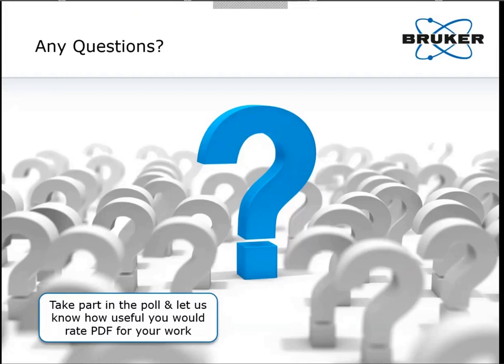Yes, that's correct. So the sample needs to meet two requirements. The sample should be absorbing enough that you don't penetrate the sample too much, and you need to have quite a lot of sample so that you are certain that you're only measuring the sample powder and not, let's say, getting signal from the sample holder, because that will influence the results. So if you have a lot of powder and it's quite absorbing, like an inorganic powder, then this works quite well.